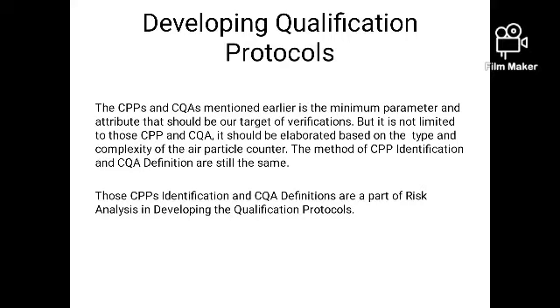The CPP and CQA are not limited to what we have discussed earlier. You can elaborate with your own technique and your counter's complexity. The CPP and CQA analysis is also a part of risk management in developing the qualification protocols. Hope you all can do the qualification better.